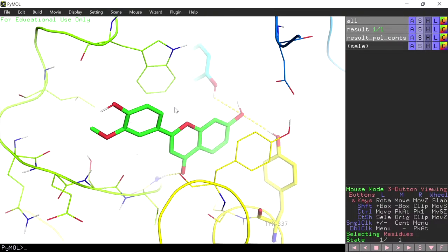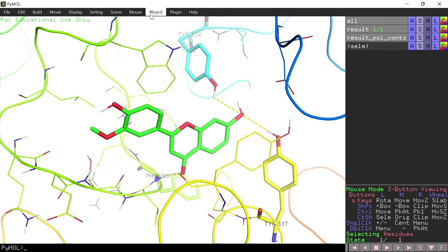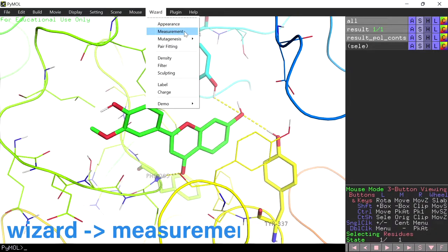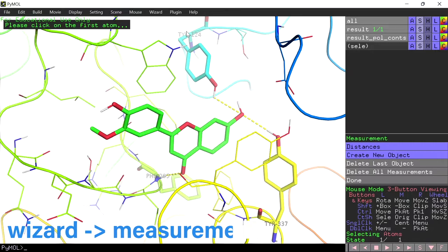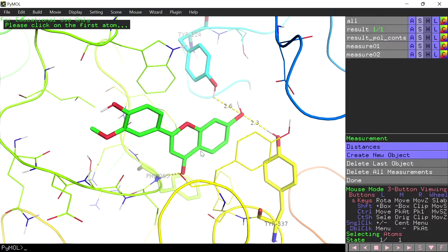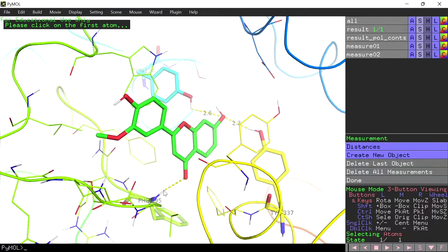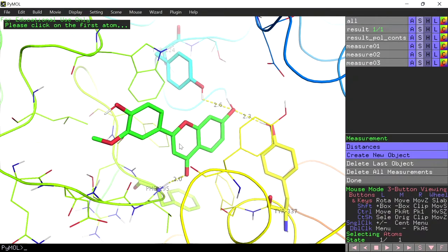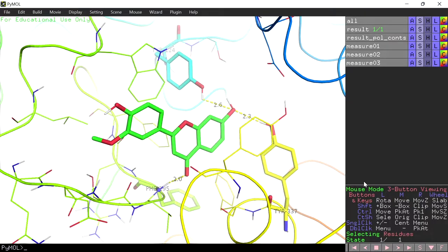You can adjust the clipping. Then go to wizard and measurement to get the distances between the interactions. Select the pair of atoms which are interacting to get the distance. After the measurement is over, click done in the measurement panel. Now we have labeled the amino acids and measured the distance between the atoms.